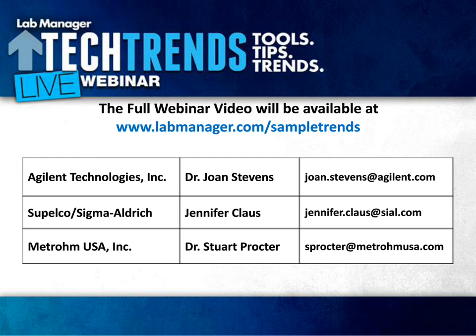Also with SPE, going from larger cartridge sizes down to the 96-well plates, that works out from that perspective. And of course, what Jen said about huge glassware, that's also what you're seeing. You're seeing everything in a smaller size, it's much greener, it's less hazardous for those that are working with things, and so, oh yeah, most definitely.